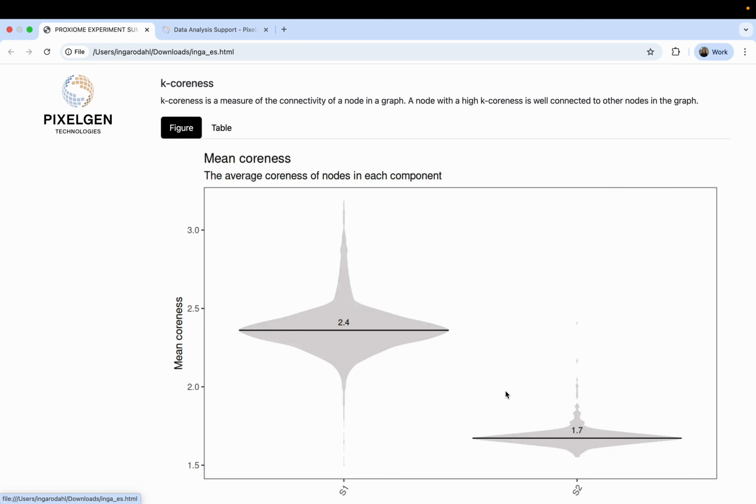Now we can look at the UMAP visualization of this, and here you see the different cell types as described, with CD8, CD4, NK cells, monocytes, B cells, dendritic cells, and also platelets. The experiment summary also does a second level of annotation, which is a bit deeper, where it, for example, annotates naive CD8 T cells from memory cells.